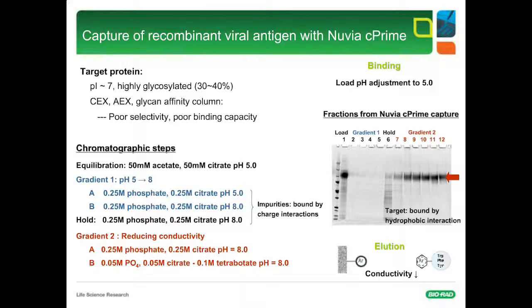That's our experience. And you've also seen on my slides, the elution peak is always sharp. On the other hand, if you do see tailing of your elution peak, that indicates that there are really mixed modes involved in the interaction between your target and the chromatography media. So if this happens, we want to look into your condition and your method development history to tell what kind of interaction is the main force causing the binding of the target molecule on the resin. And we can start from that, help you improve the elution efficiency.